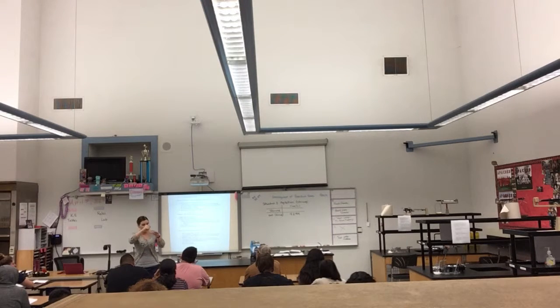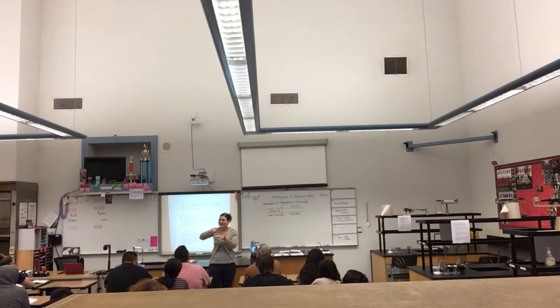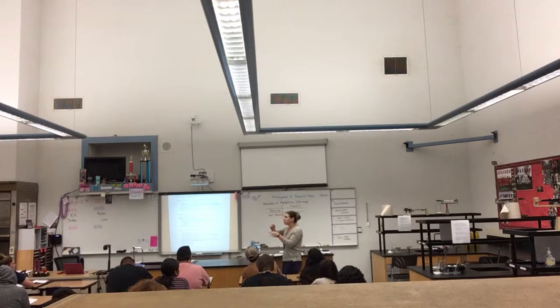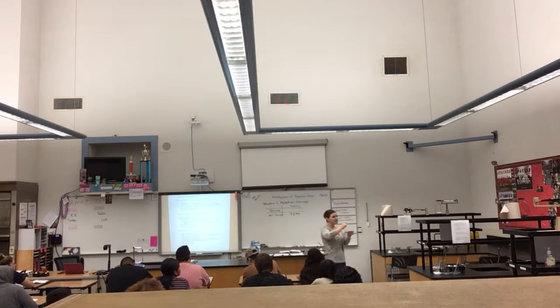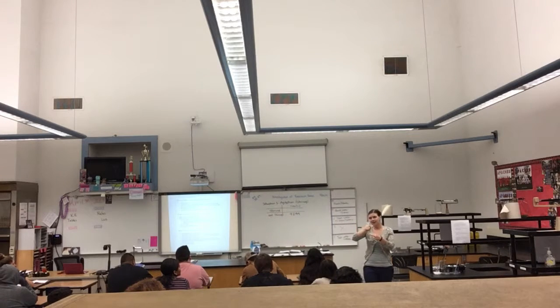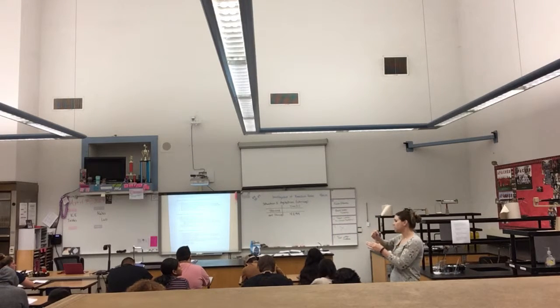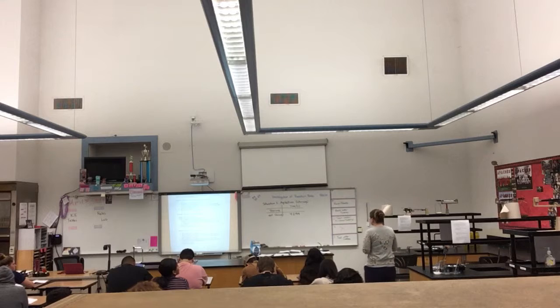So what I would ask that you guys do for stirring is to do a slow, steady stir. Just a slow, steady stir to get that water moving. I do not want to hear clinking. You do not need a vortex down the center of your beaker. Please, just slow, steady stirring for the stirring situation. So that's what you're going to be doing for the first situation.